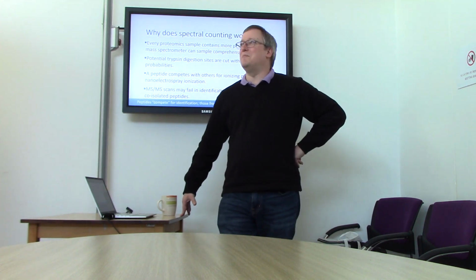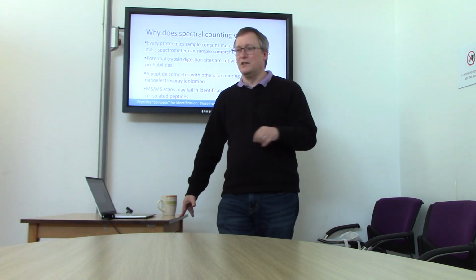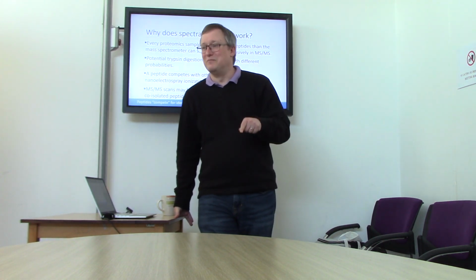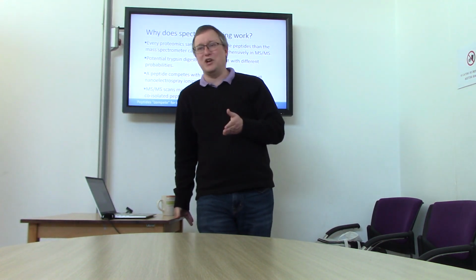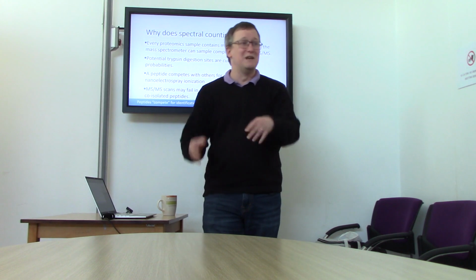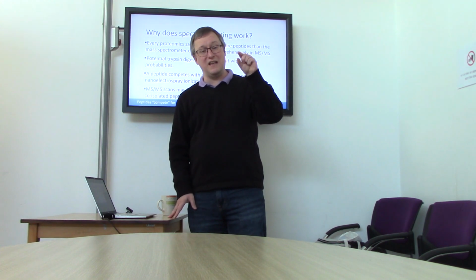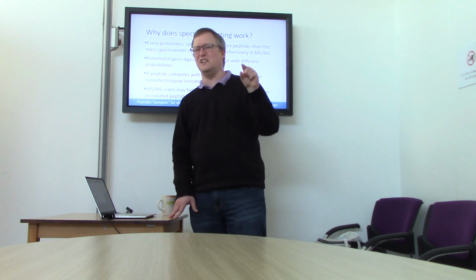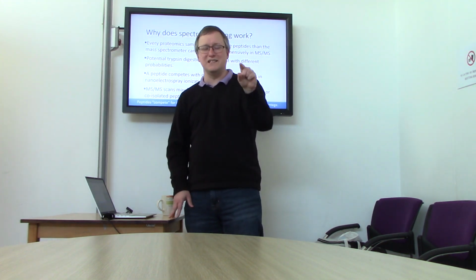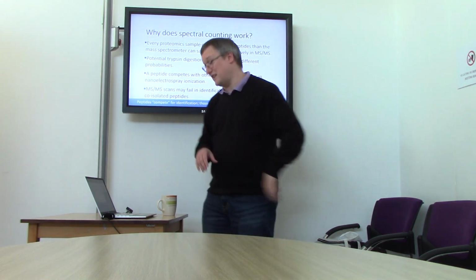I kind of think of a mother bird coming back to the nest with a nice big worm, and all of the chicks are all squawking at her, I want the worm, I want the worm, I want the worm, right? And the one that squawks loudest gets the worm. So if you've got a not thriving chick, it's going to become less and less able to compete for the worm brought back to the nest because its brothers and sisters are all chirping too loudly. Okay, in the same way, a peptide ion that is of middling intensity, not a huge one, that's in a really crowded time of the LC-MS landscape, may not be sampled for tandem mass spectrometry consistently. This is a competitive process.